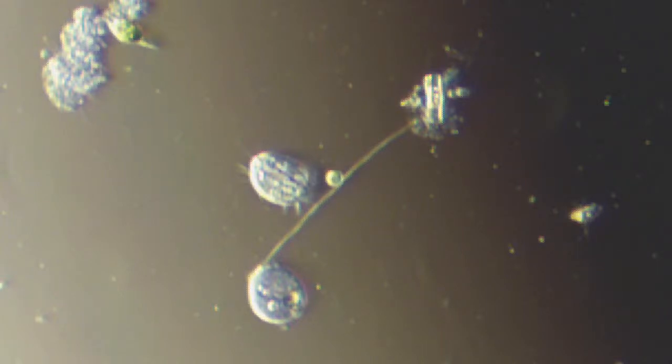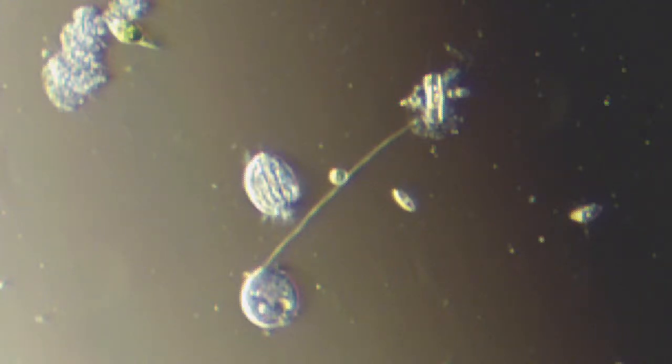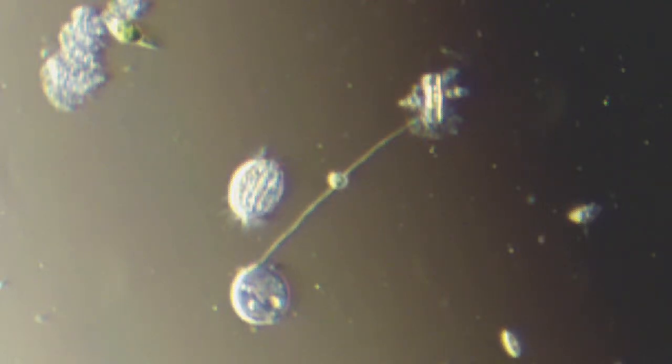DIC is superior. And then you get into fluorescence microscopy where you can make stuff glow under certain light conditions. It's really good stuff, but man, it's a lot of money. It's amazing what you can do with a pretty standard compound microscope like this one, and some knowledge of how the light works, using patch stops and other tricks, color filters above the condenser or below the condenser. Stuff I wish I had known back in college. Not even the lab techs and the people who work with this stuff all the time knew these little tricks. Teachers didn't know it. Nobody knew it. Took me like over 20 years to find out some of these tricks.